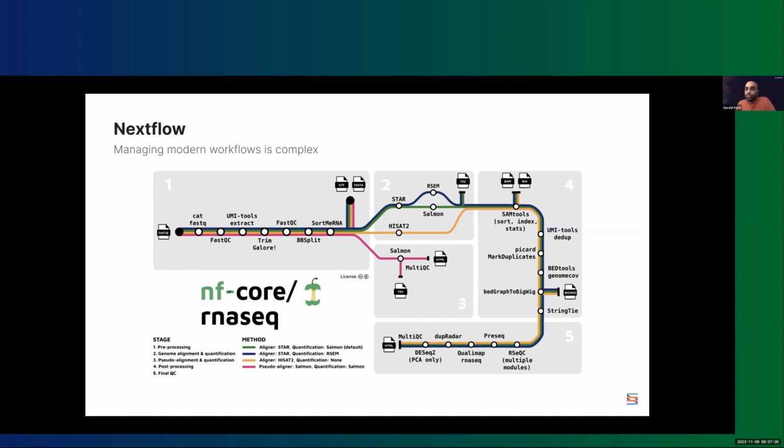I'm sure a lot of you have heard of RNA-seq data. And so one of the gold standard pipelines on NF Core is the RNA-seq one. That's mostly because there's just tons of RNA-seq data knocking about. But it's also tended to be the one where we push our most cutting edge changes in terms of Nextflow development and iterations of how NF Core adopts Nextflow within the community.